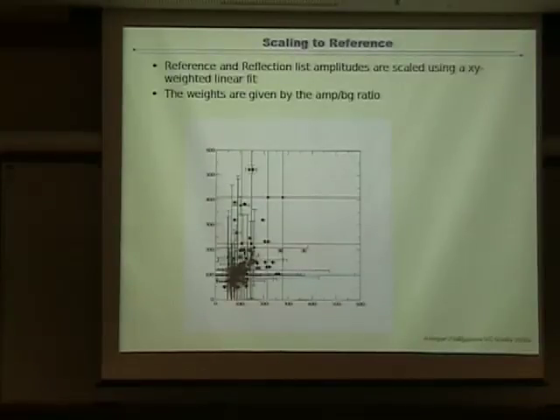So again, this is the philosophy. We're not chucking away any data. The data that is bad is just weighted extremely low. The linear fit that we get here goes through 0, so we force it through the origin. That's also something that I would like to discuss. Does that make sense? Can there be a constant factor for a diffraction image, for the amplitudes, or does it make sense to force it all through 0? In our experience, if we let go of the intercept, things can go haywire, so we force it through the origin all the time. But it's one line in the code to change, and I'm very interested in the experience from the audience on how to do that.